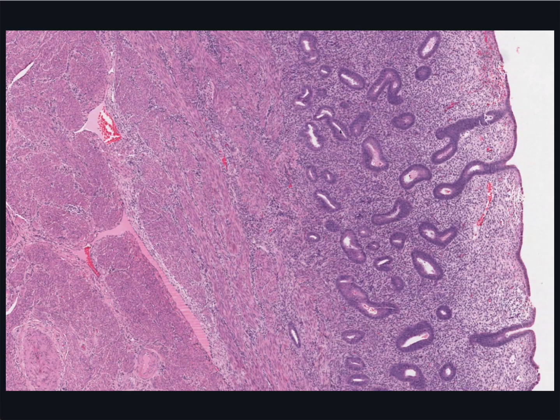The follicular phase of the endometrium can also be called the proliferative or the estrogenic phase. This section represents an early stage in the menstrual cycle. Once again, view the myometrium, comprised of bundles of smooth muscle cells separated by seams of connective tissue, and again, see profiles of many uterine arteries. The endometrium is very shallow.